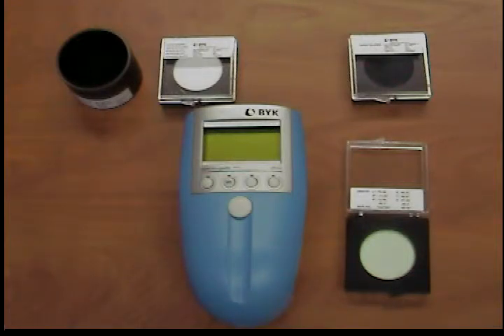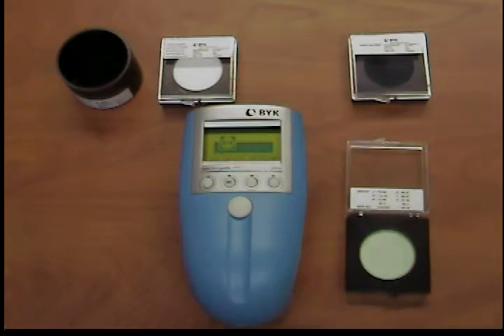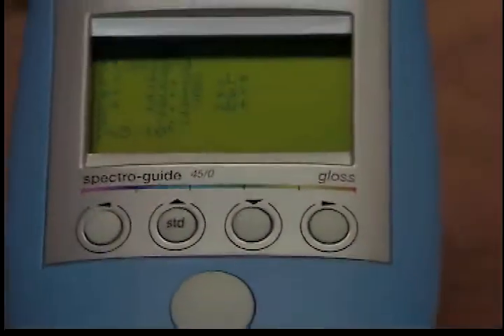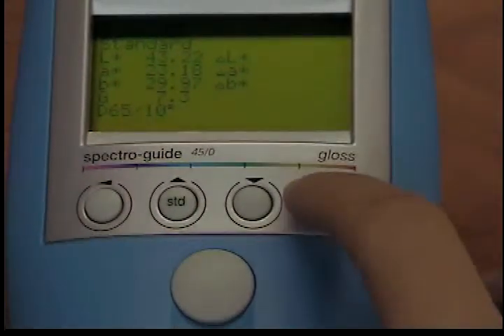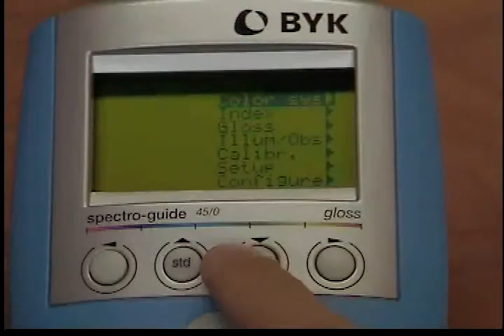Check green. To determine whether recalibration of the instrument is necessary, perform a test measurement with the green standard. From the option menu, use the cursor keys to place the cursor on the calibrate option. When you press the operate button, the submenu opens. The option check green is pre-selected.